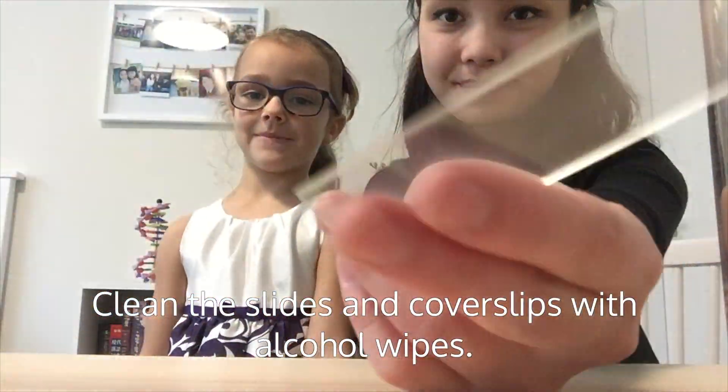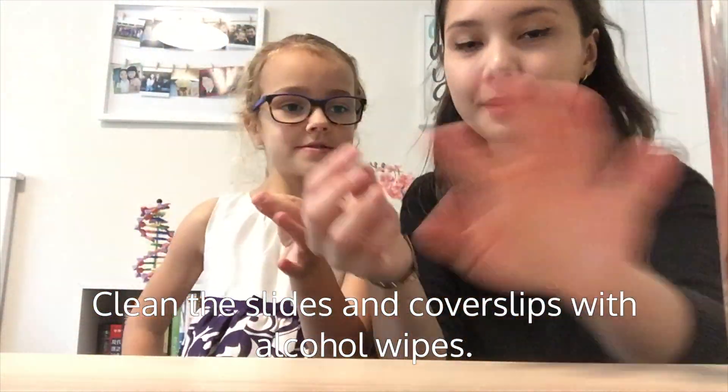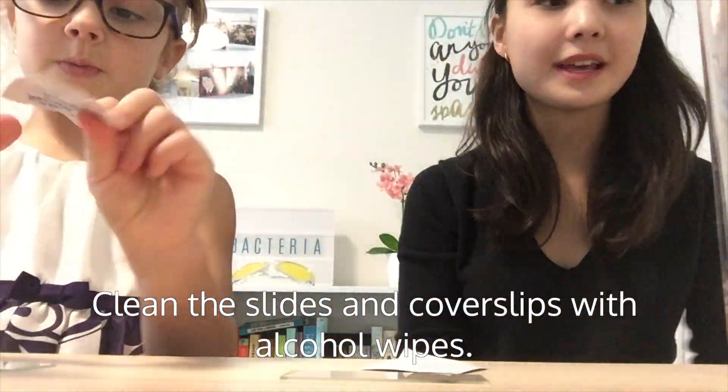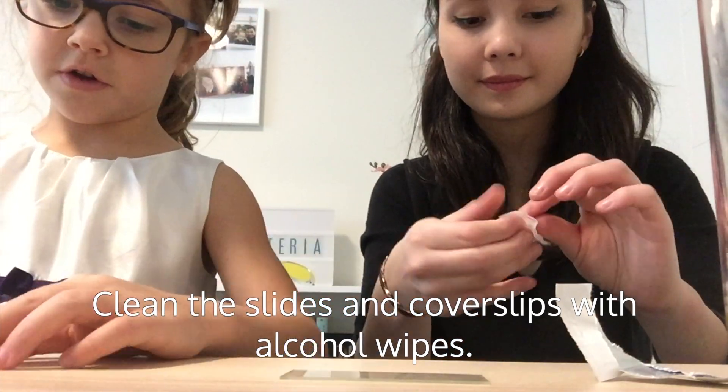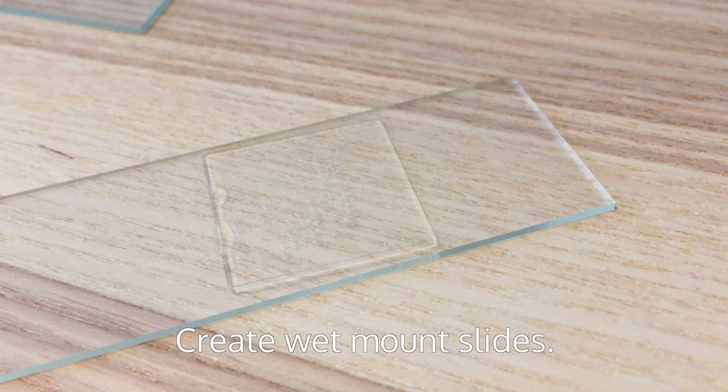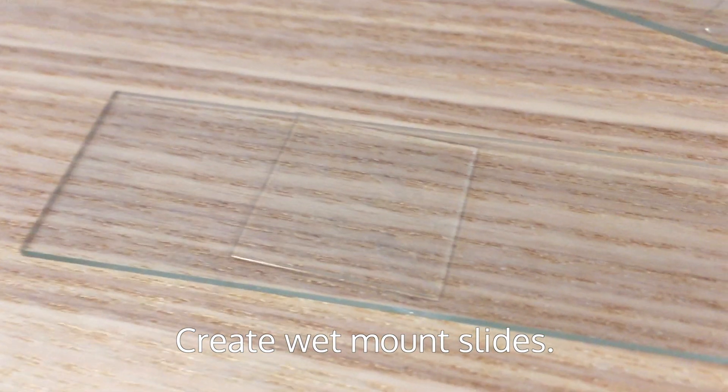Then, take your slides and clean them using the alcohol wipes. Be sure to clean your coverslips as well. Making sure that the coverslips and slides are clean will ensure that there is no dust in your slide.